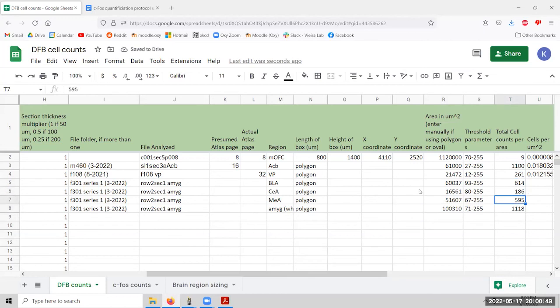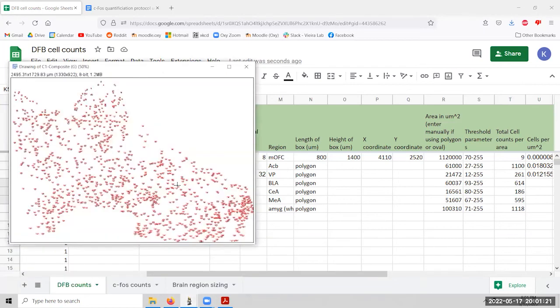100,310. And looking at this, it's definitely less than the sum of these. So the sum of these would be closer to about 1,400-ish. So we got 1,100. So we could see that we did miss out with some of the precision, but I think that's still an acceptable margin of error. We might have also included some pockets of space that normally were not counted by all the individual counts that we have here. So that's the amygdala nutshell. It's up to you whether you want to do subregions or the whole amygdala and then subdivide it later, but this is one way to go about it.